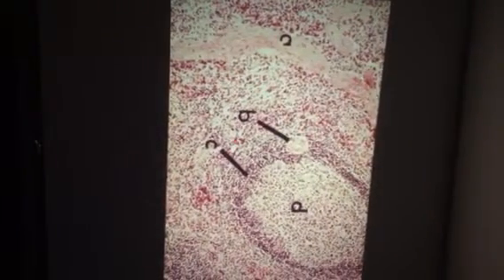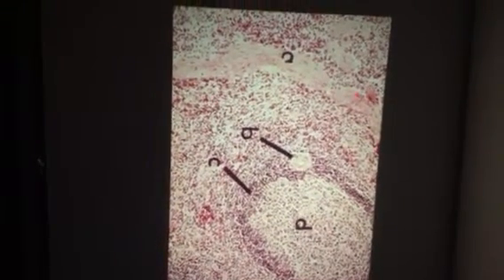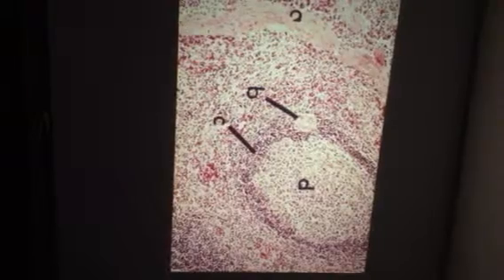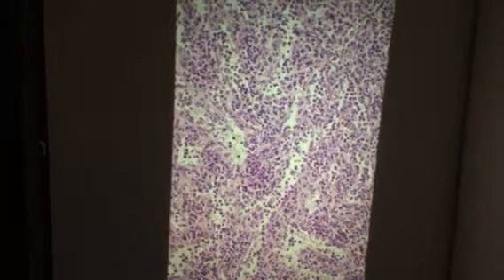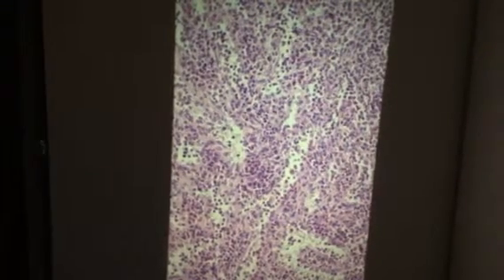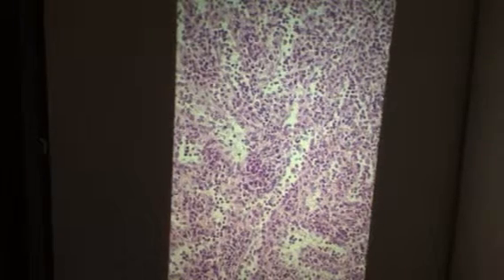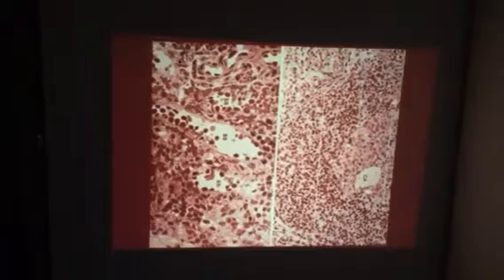Okay, well there's another central artery right there with the periarterial lymphatic sheath. There's a trabeculum. Oftentimes you'll find a vessel in that trabeculum, and there's a germinal center in a splenic nodule. And then out here would be red pulp. And this is a close-up of red pulp. There is a venous sinus, and you can just get a hint of those stave-like endothelial cells which line that splenic sinus. So that allows access from the blood in the pulp to go into the splenic sinus or the venous sinus. So in the open system, the blood is going to be dumped into the parenchyma of the red pulp and then finally make its way into those venous sinuses, and eventually into the splenic vein, which will join the portal vein. And that's the same thing, so let's go ahead and go on.